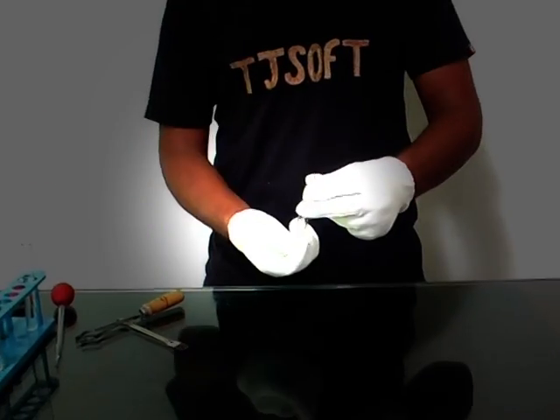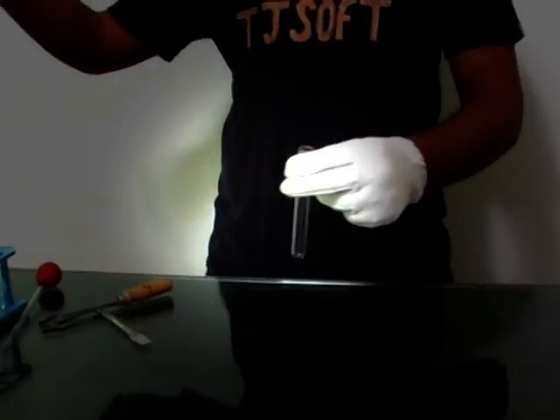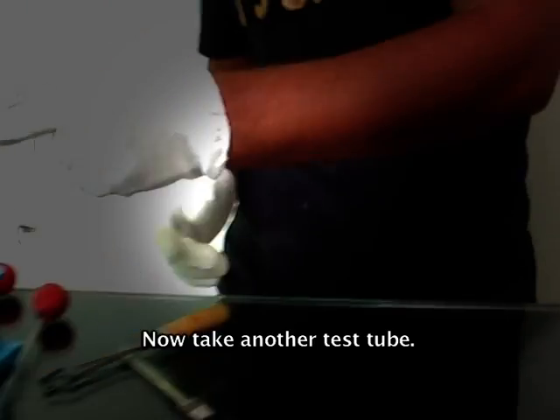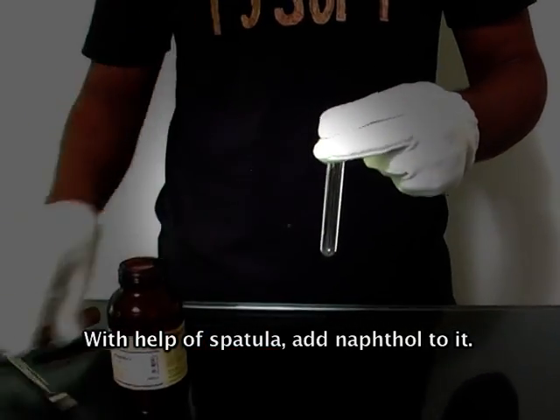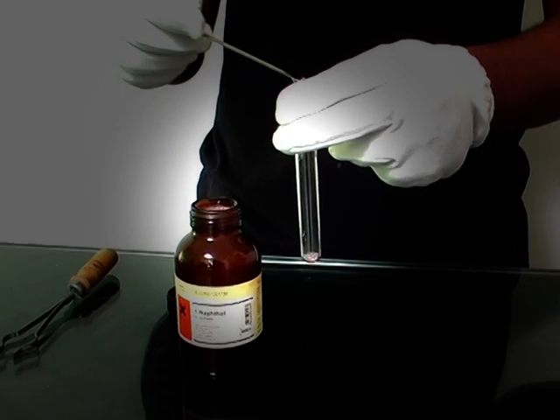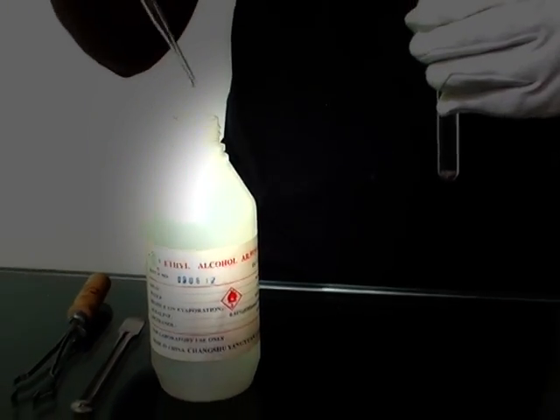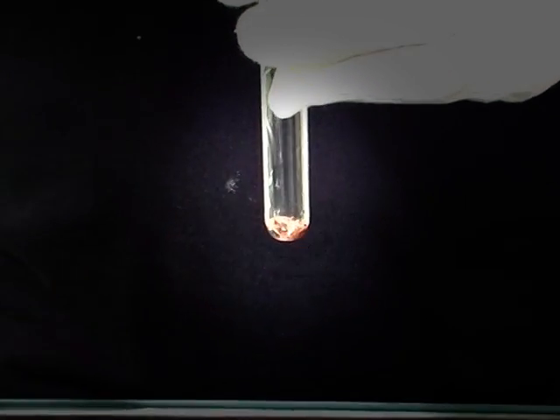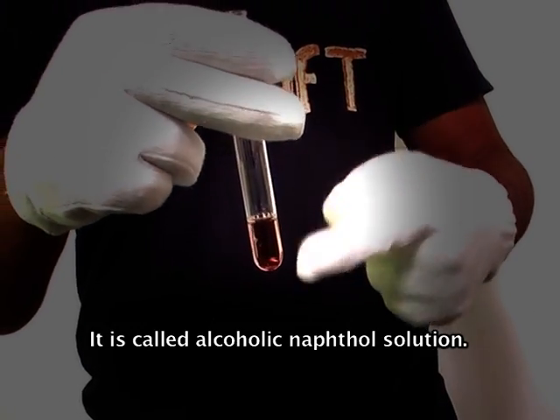Now take another test tube. With the help of a pipette, add 1 ml of glucose solution to it. With the help of a spatula, add naphthol to it. Now add alcohol with the help of a filler to the test tube and shake it well. It is called alcoholic naphthol solution.